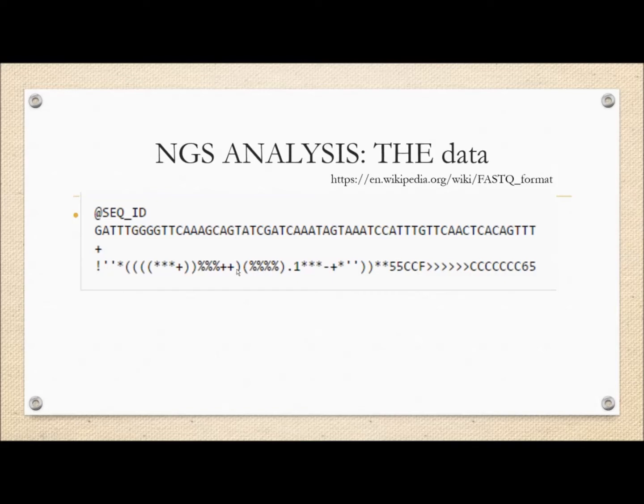Remember, sequencing processes are prone to errors, right? For example, you might have a fluorescence that doesn't work at that particular time, so you might have just an empty space, or you might have something where the color is not very distinct or is very faint, and the software makes its best estimate that, well, at this point in time it was a thymine that was added. So let's look at this one, A. The confidence level of A being in this position correctly is denoted by these symbols. And these symbols range over a pretty long range.